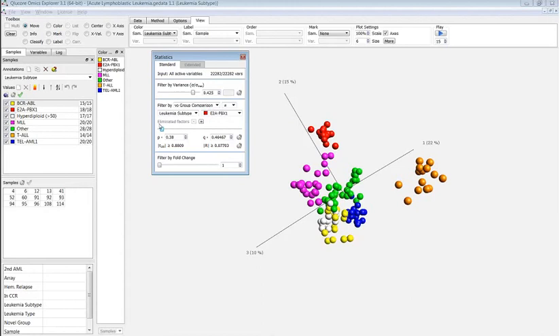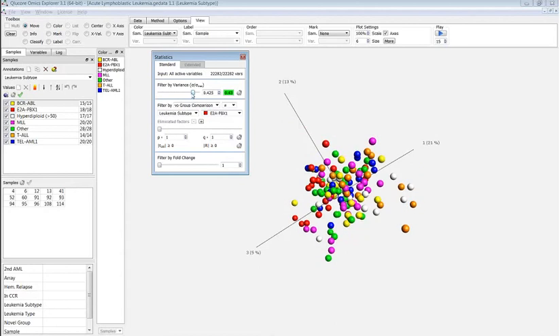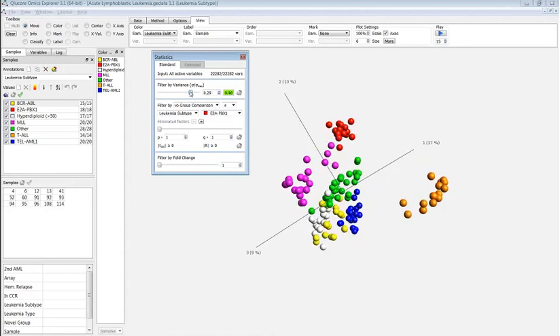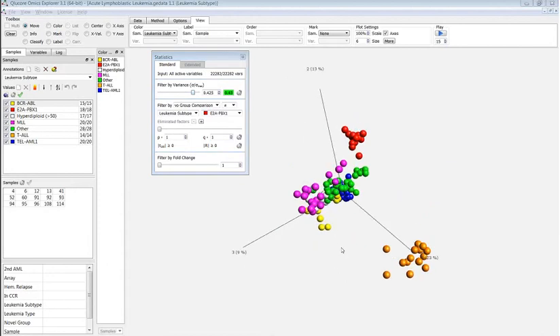Of course, you could base it on other measures, but that would require different calculations for the null distributions, etc. Variance filtering is often the starting point for analysis, and that's where you would like to do the coarse filtering and get an optimal stopping point. From there on, you can start refining your analysis.